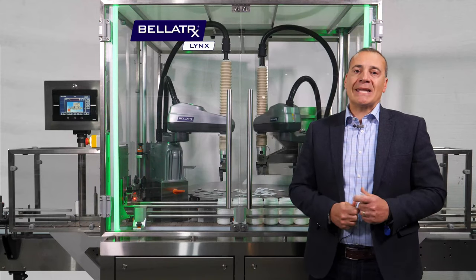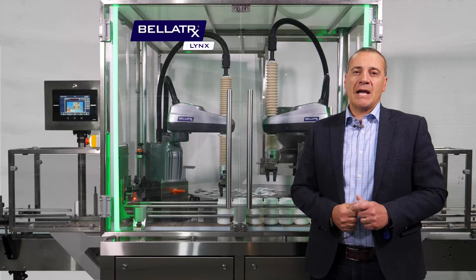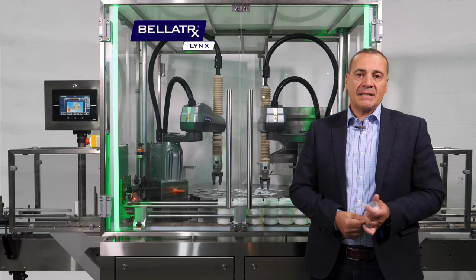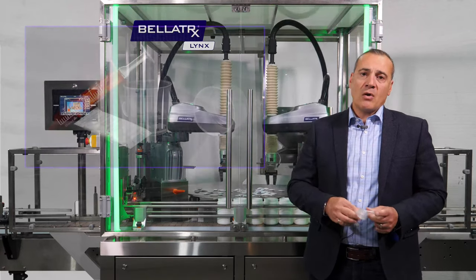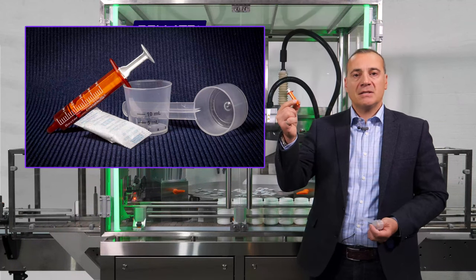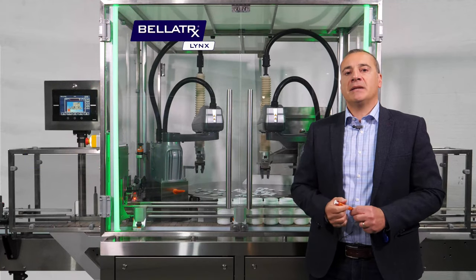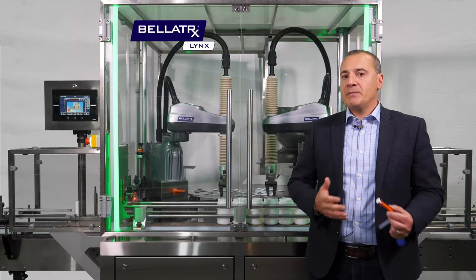Today we're going to be talking about our Lynx new part feeder that we put on pharmaceutical lines to feed items like desiccants, desiccant inserting, or putting scoops in, syringes, or dosing cups — any parts added to a packaging line that require manipulation.